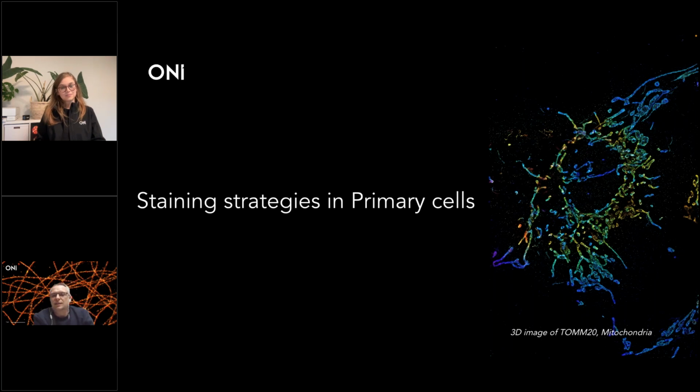What you need to make sure is that you have a very thin tissue slice. The strategy for labeling in tissue is exactly the same as the strategy you would use for labeling a tissue for confocal imaging. But when you are going to do the imaging, you will need to use the imaging buffer which is compatible with the fluorescent dyes of the antibody that you're using. But make sure that you have a very thin slice of tissue.